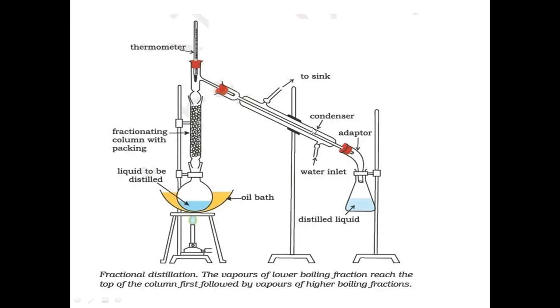what you want to do, you have to use fractional distillation, so it separates the mixtures based on fractions. The only difference between the simple distillation and the fractional distillation here is the use of the fractionating column present in the fractional distillation. This is a fractionating column, which allows the various components of the mixture, which all evaporate, to move up here at different rates and prevent them from mixing. So here they are all liquids and they all evaporate. When they get here, they all move at different rates, and the fractionating column prevents them from getting mixed.